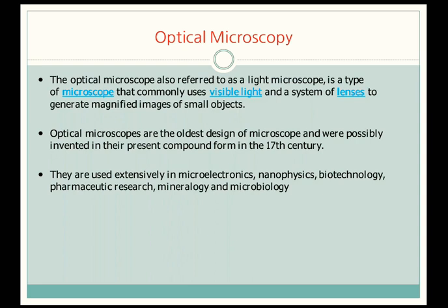Microscopy is used extensively in microelectronics, nanophysics, biotechnology, pharmaceutical research, mineralogy, and microbiology. It is also used in criminology, because there they want to examine fingerprints or hair particles of a suspect, so they use microscopy in the criminology field also.